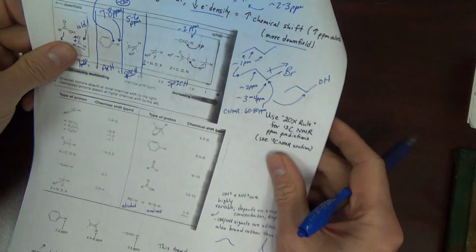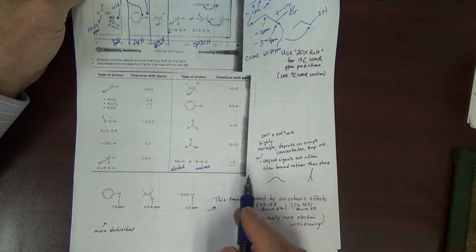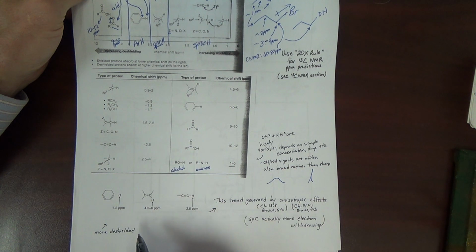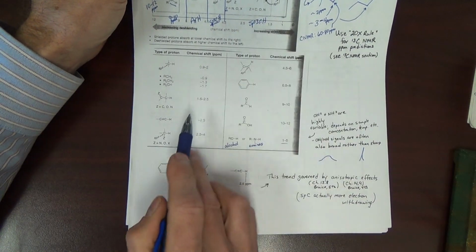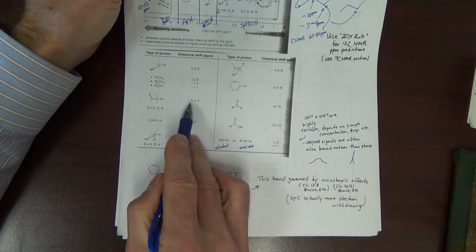Okay, peak position's never going to be exact like these tables. They give you some range. The range is often a little bit bigger. Well, here is kind of exact up there. Here they say 1.5 to 2.5. Could even be closer to 3.